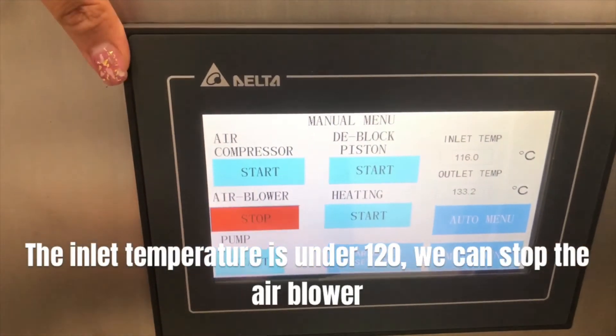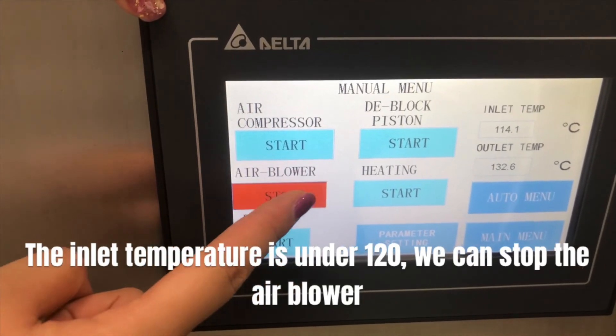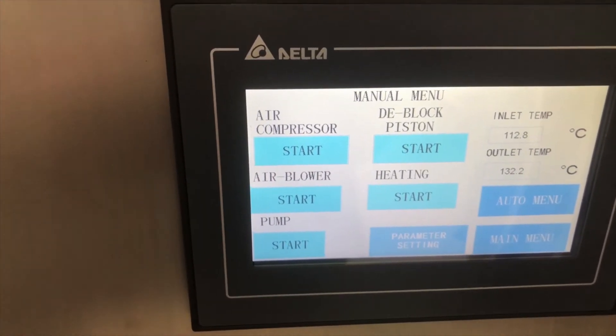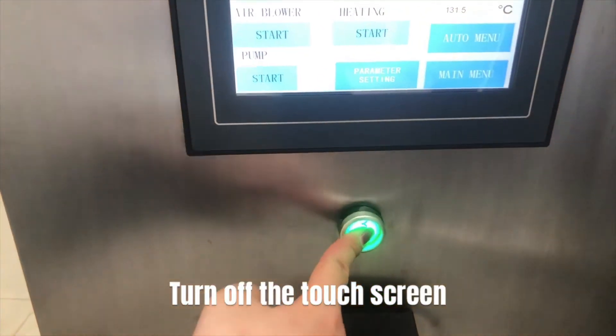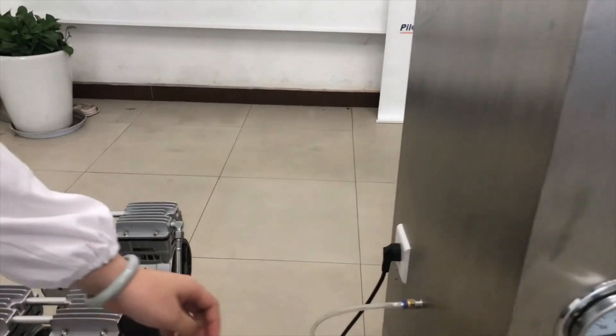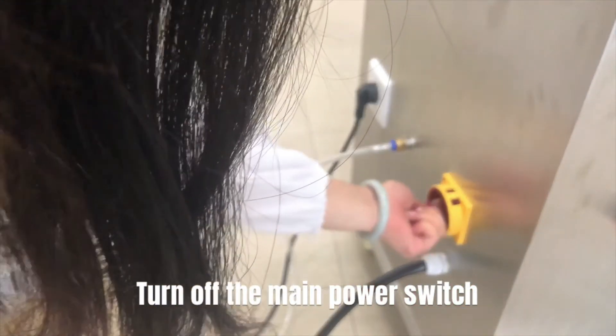The inlet temperature is under 120. We can stop the air blower. Turn off the touch screen. Turn off the main power switch.